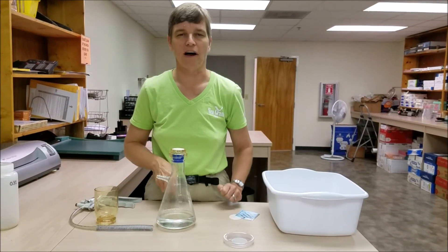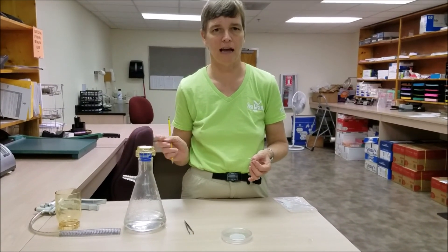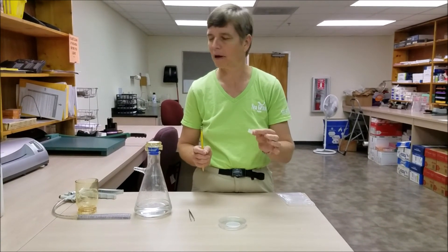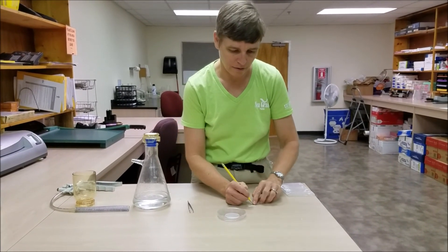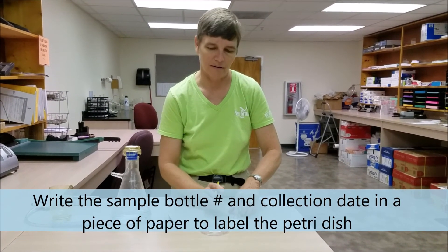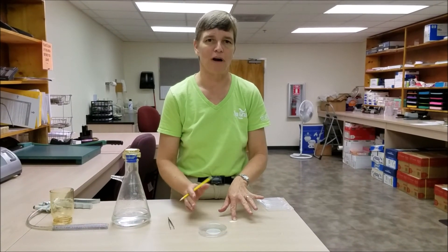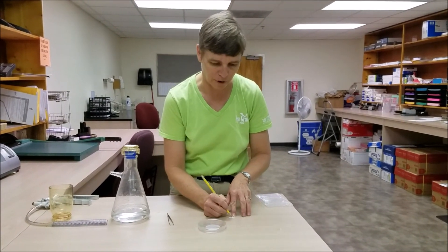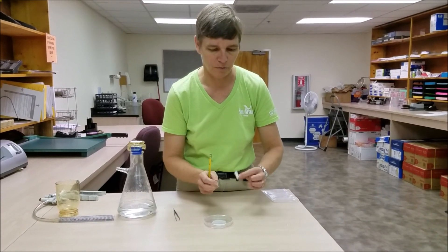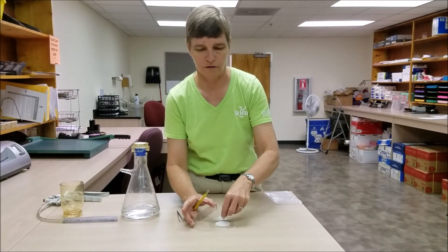Our sample is now ready to observe. In order to identify the filter and the sample it came from, use a small piece of paper — I'm using waterproof paper. Write the sample bottle number on it and also the date that the sample was collected. This way, if the filters are sitting around for a while, you can keep track of which sample came from when. That little piece of waterproof paper can simply go in the petri dish with the piece of filter paper.